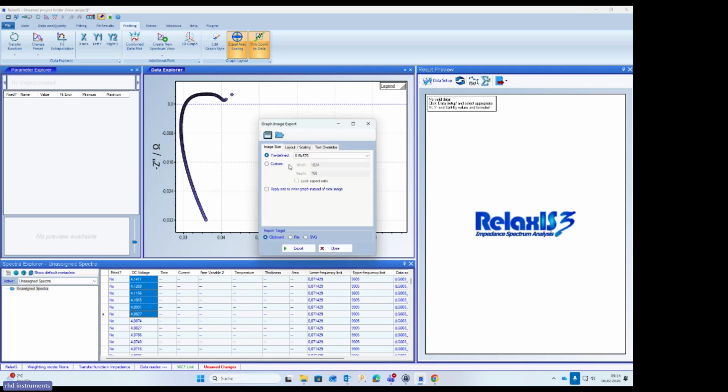And here you can export a graph image based on your predefined resolution, or you can just also copy it to clipboard. For instance, if you directly want to paste it into your PowerPoint presentation, you can create a file or also vector graphics. So this is all possible here.